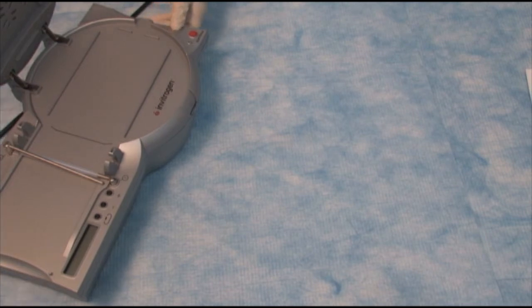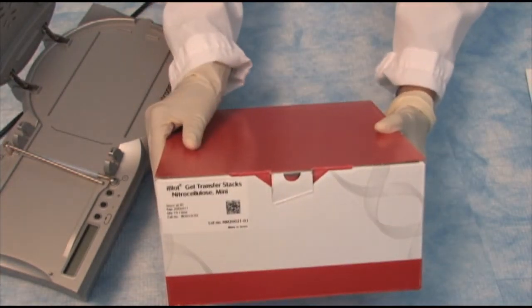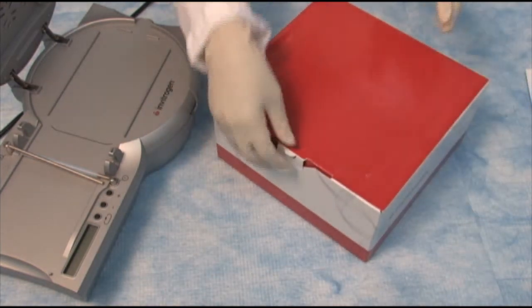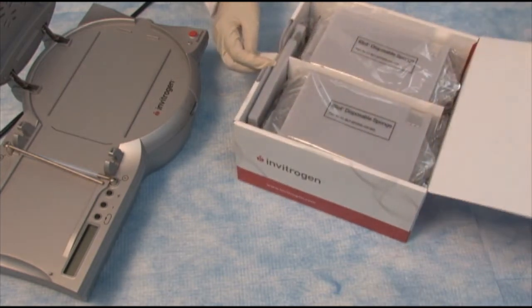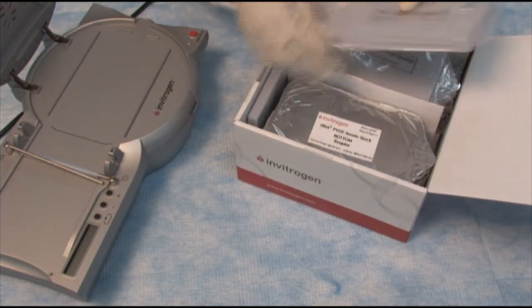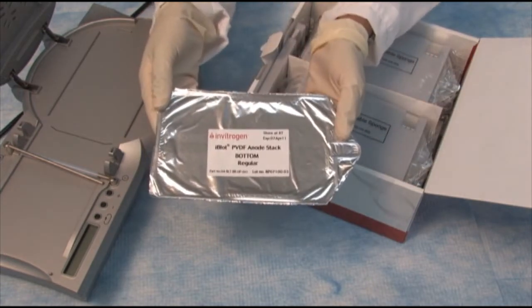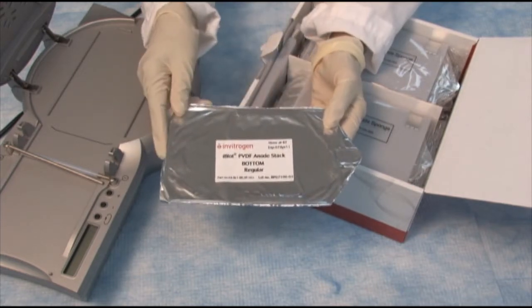Now let's take a look at the transfer stacks. You have a choice of either PVDF or nitrocellulose. Each box comes with enough stacks for 10 transfers and they come in two sizes — a mini size or the regular size, which is large enough to transfer two mini gels at the same time.